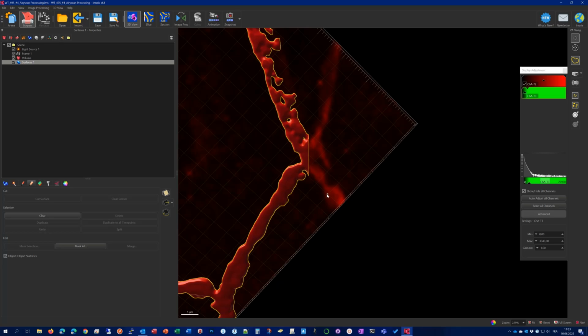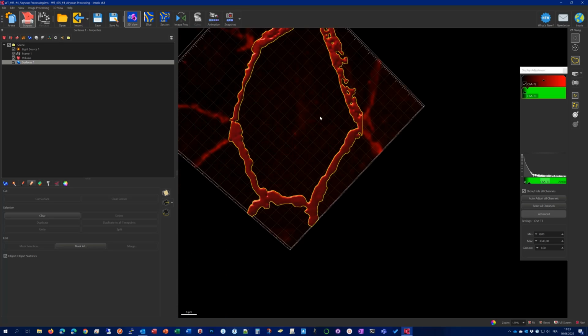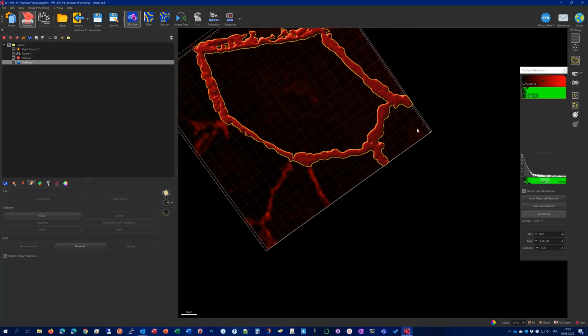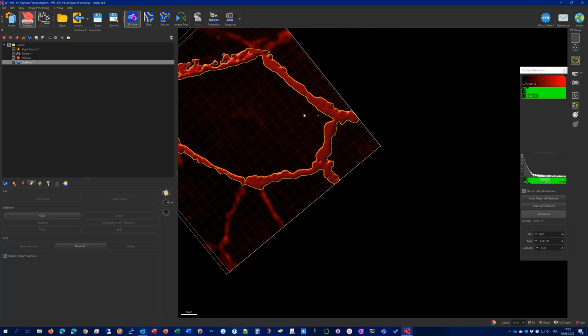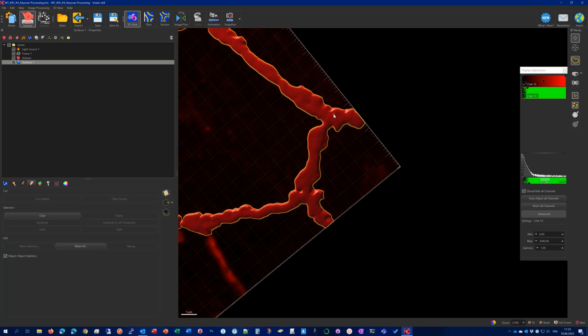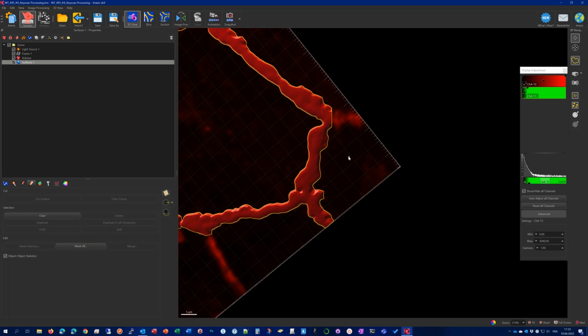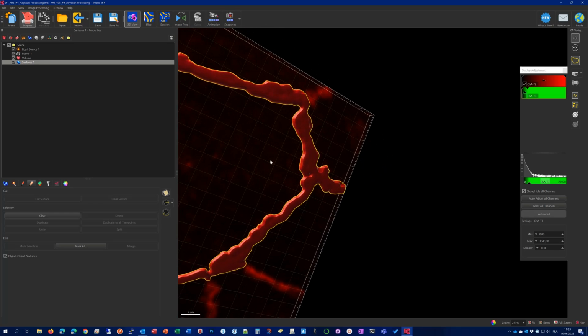Okay, and we have just two more here to cut quickly. Here. And the last one.